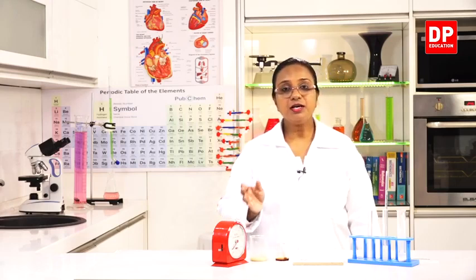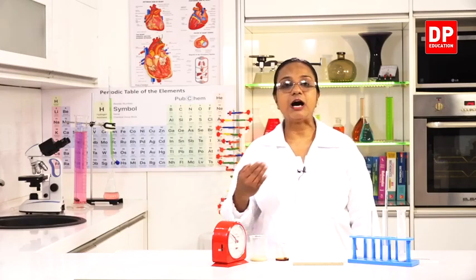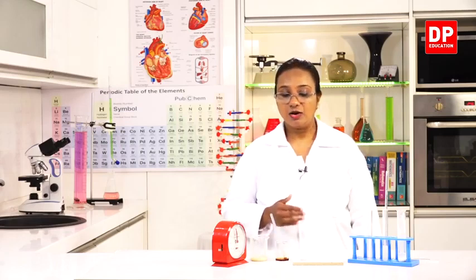So as you know, amylase is an enzyme that acts on starch and hydrolyzes it to maltose. All the starch that was present in the reaction mixture has now been converted to maltose. So that is the reason we do not get a color change. Only the color of iodine is visible. So with this observation, students, we can clearly understand the activity of amylase on starch.